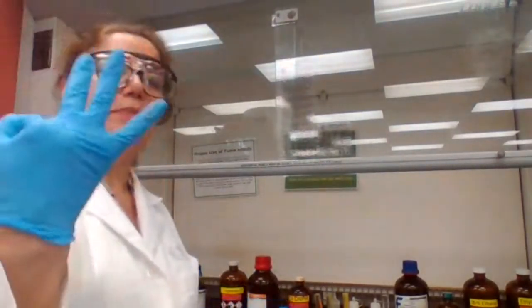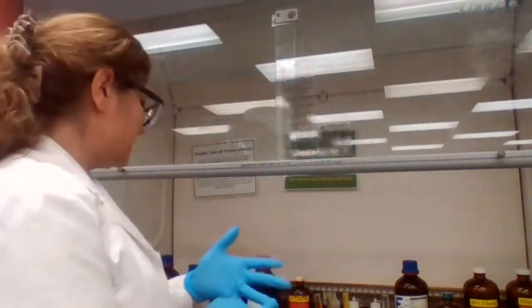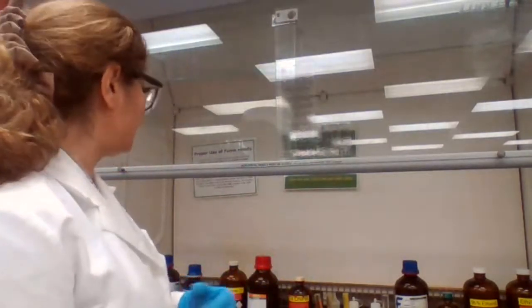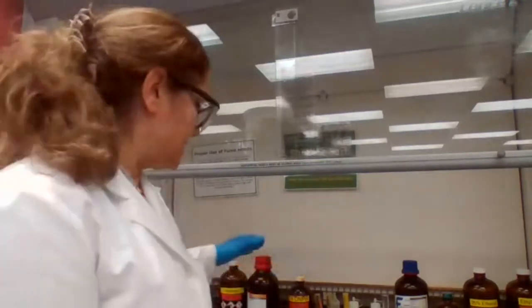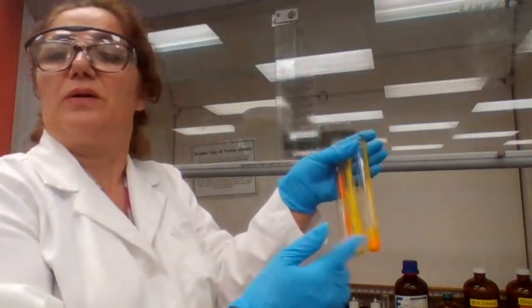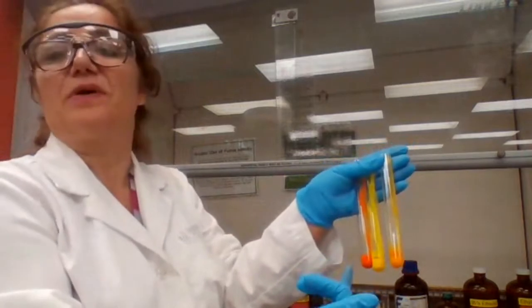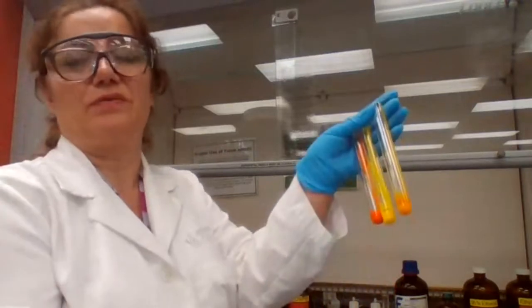So we are working with 3 compounds: one cyclic ketone, one aryl ketone, and one aldehyde. So it's cyclohexanone, acetophenone, and butyraldehyde. All 3 compounds are positive, yes. You mix them all separately in separate test tubes with the 2,4-dinitrophenylhydrazine. The precipitate is the positive result, not the color. The precipitate is what is going to give you the positive test.